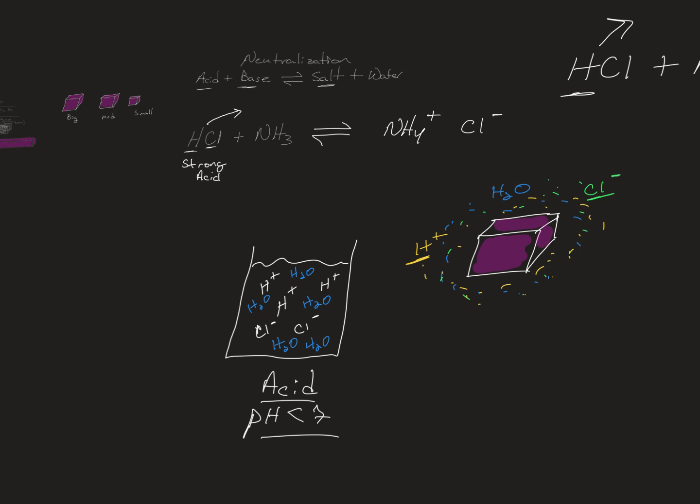Do you remember the gorilla in the movie? I showed you the gorilla in the movie, didn't I? All right. We know they're going to neutralize each other. They're outside. We know that this is a gel, just like paper chromatography. What is happening in this lab? What's going to happen with all these ions in the solution out here? You said they're going to neutralize the base. You're correct. But how is the H plus going to get to the base that's in the gel?